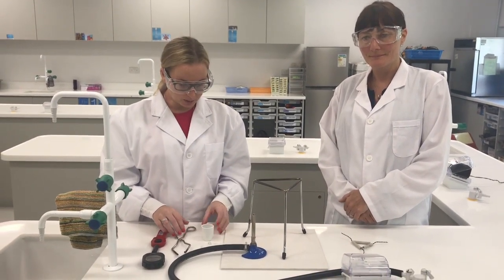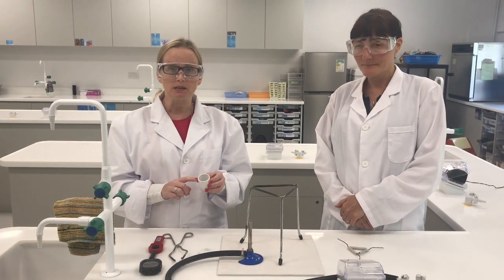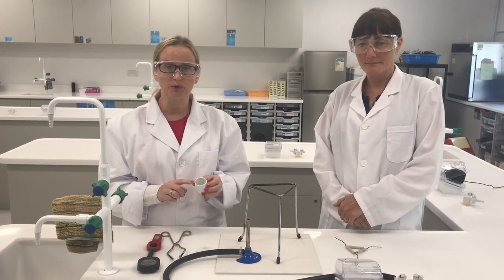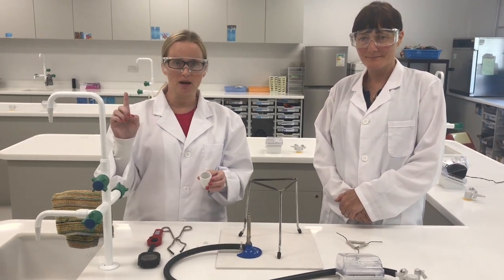In this experiment we're going to take some copper powder and react it in a combustion reaction with some oxygen in the air.